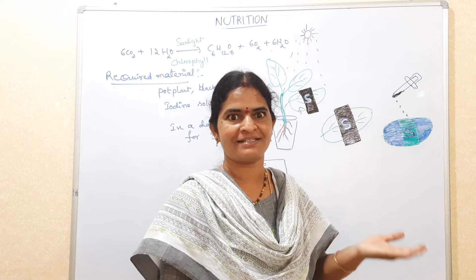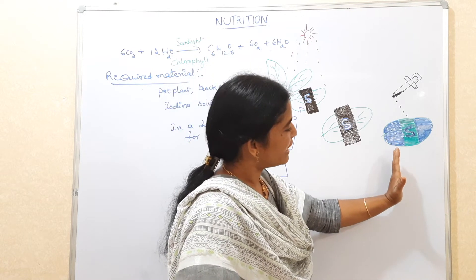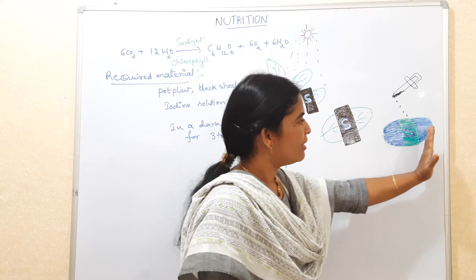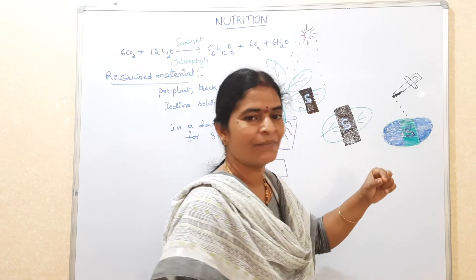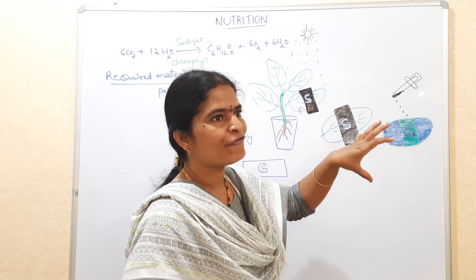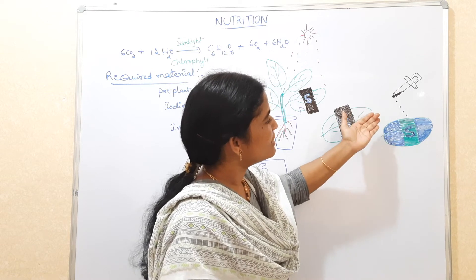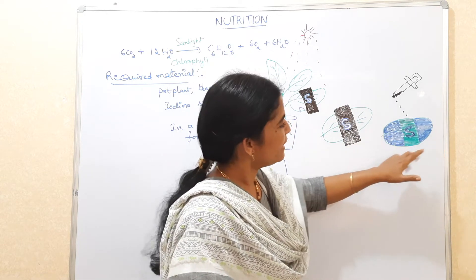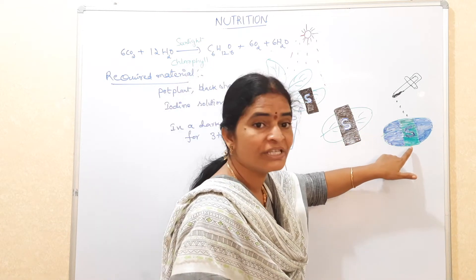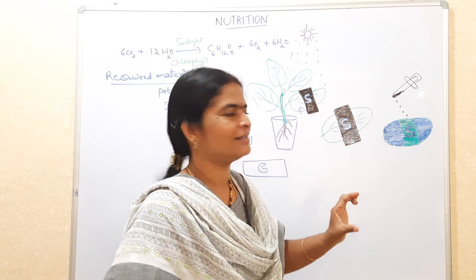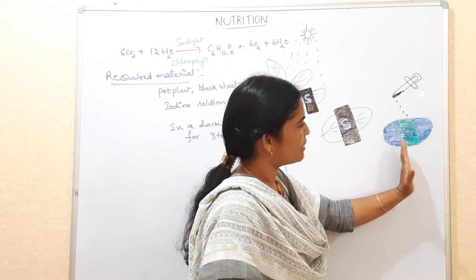Observe whether the leaf is green in color or bluish black. We can see differences in color across the leaf: the tip (apex), the base, and the part where we cut the black paper shape. Those three parts that were exposed to sunlight have turned bluish black, while the part covered by the black paper has not changed its color.